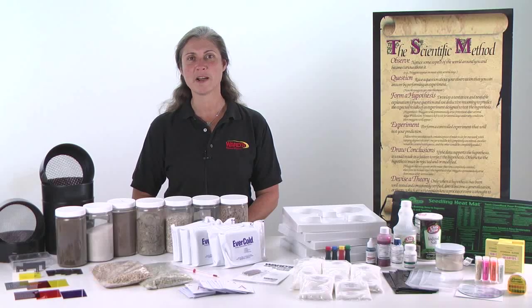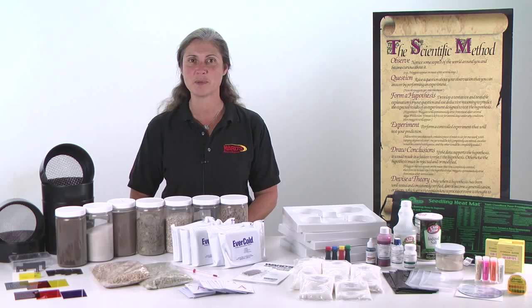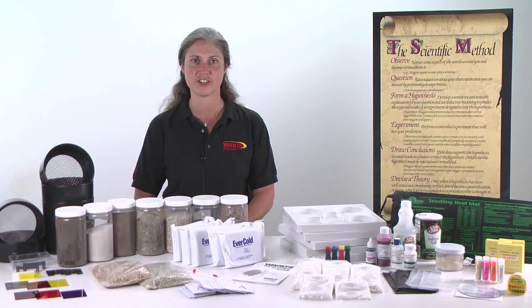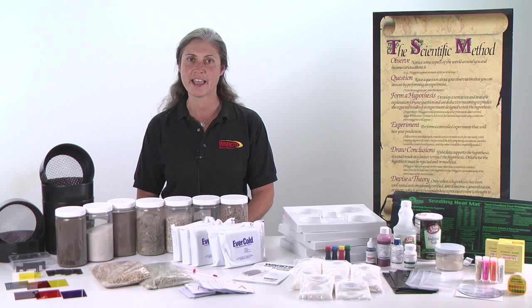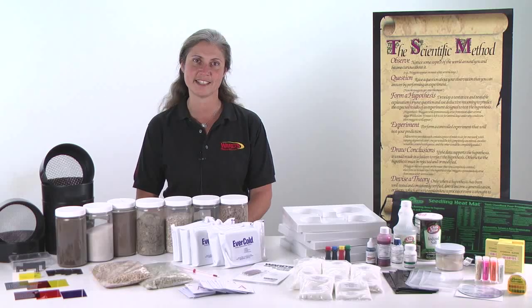WARD's Inquiry Toolbox is a great accessory to get your students thinking about science process. It also helps you and your students to meet the new AP Biology Lab standards. If you have any questions about our AP Biology Inquiry Toolbox, please contact your WARD Sales Representative.